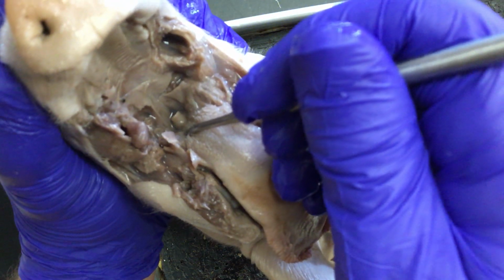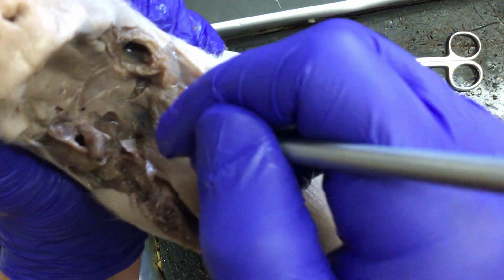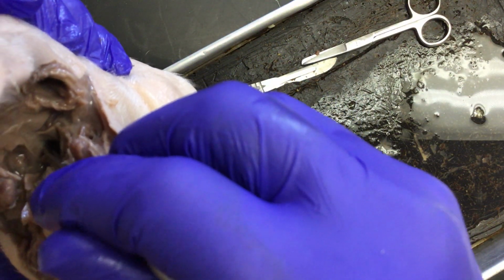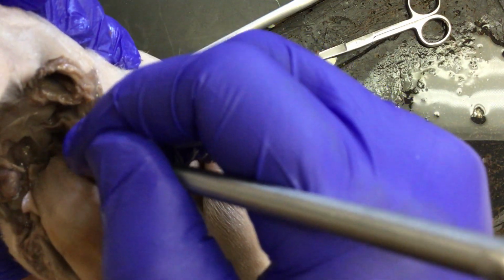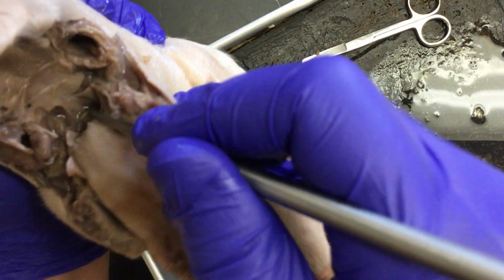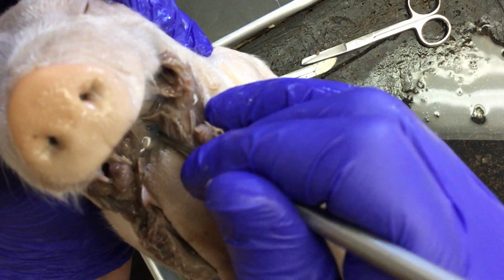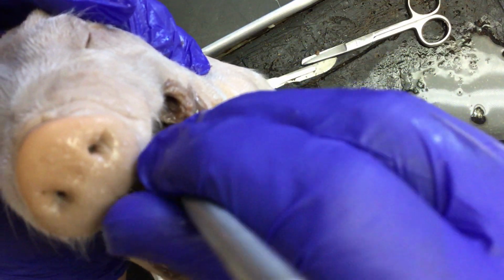All right, so we have here this little tear-shaped, boy, it just continually fills up. This little tear-shaped opening at the back here is the glottis. There is a muscle that I have torn through called the epiglottis that covers it. This is what actually leads to the pig's lungs. Then the esophagus is further down past here. The esophagus, of course, leads to the stomach.